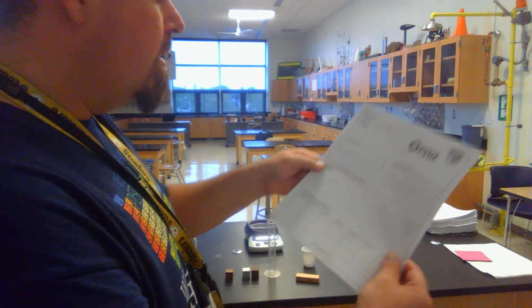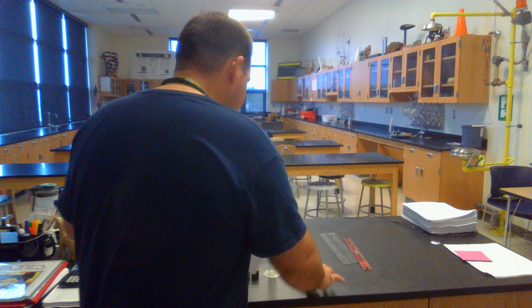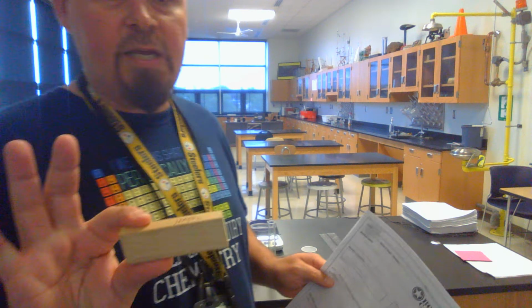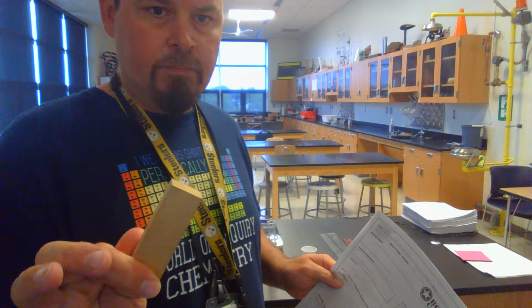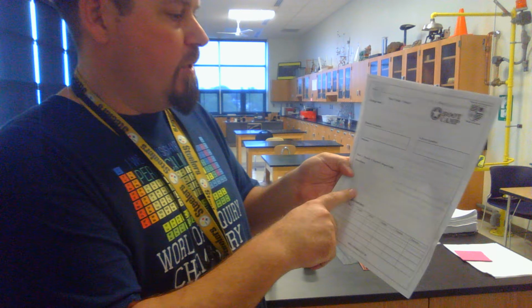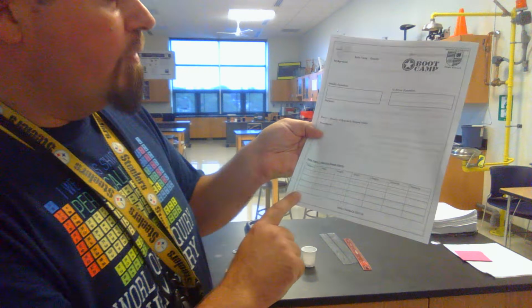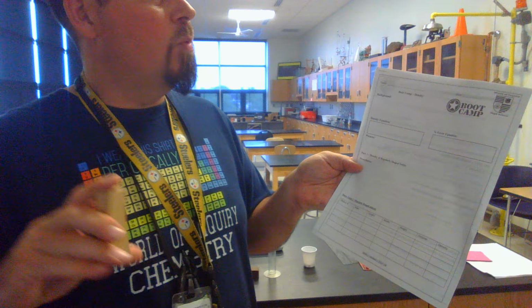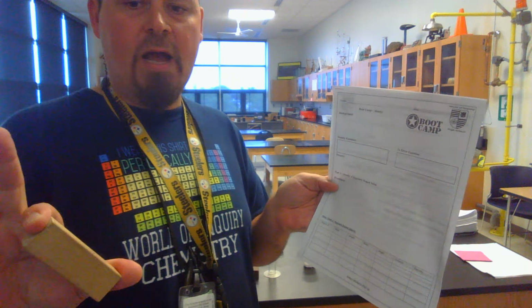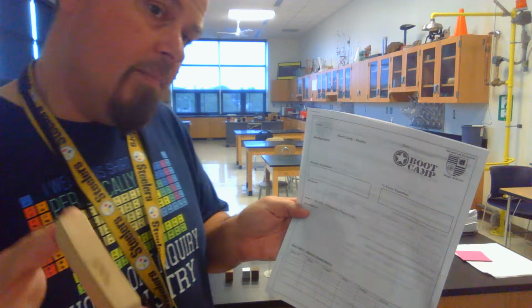Okay. Procedures for density of a regularly shaped object. For that, we are going to use a Jenga block. You need to make a change to this because you're going to write down what I tell you about the procedure, but there's going to be a change to your data table that's already done. Okay. So there aren't going to be multiple objects. What there are going to be is multiple trials of your lab partners doing the same object.